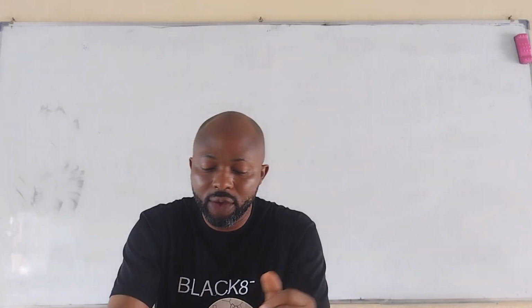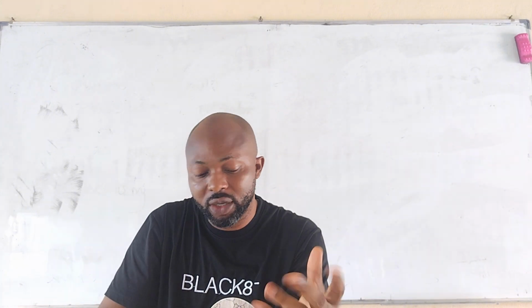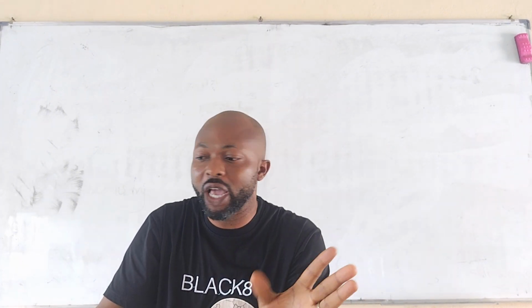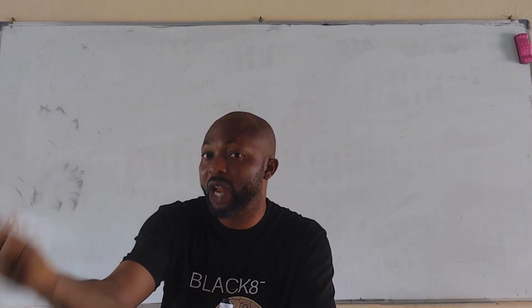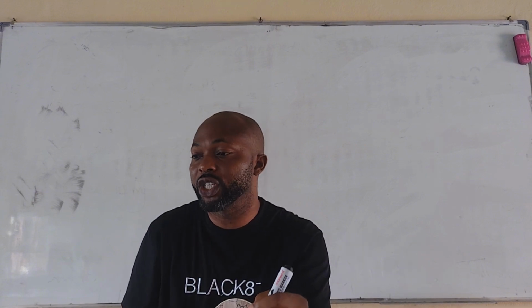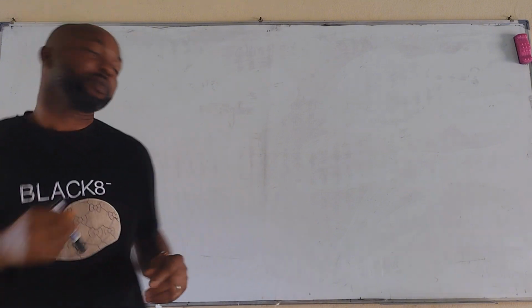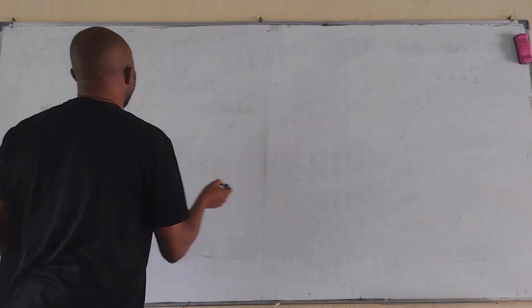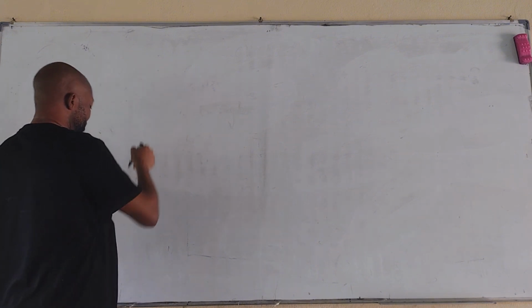So today, we're going to begin with preparation of solutions, which are acidic solutions. So we have our formulas for that. We're going to begin with the formula, then also apply the formula in terms of our calculations. So let's begin. So we have what we call the volume concentration.